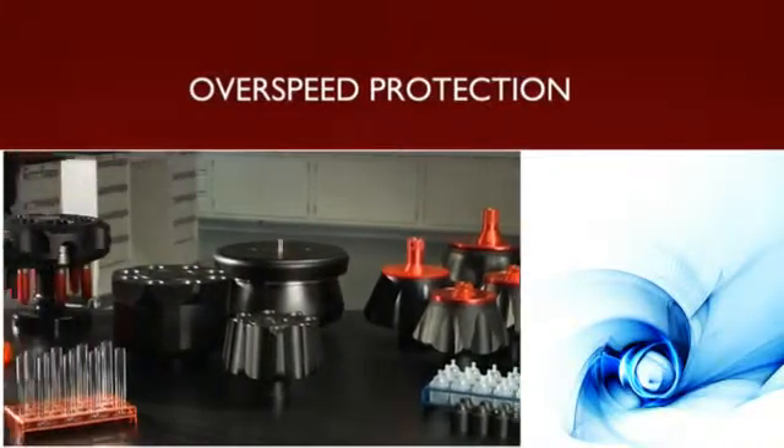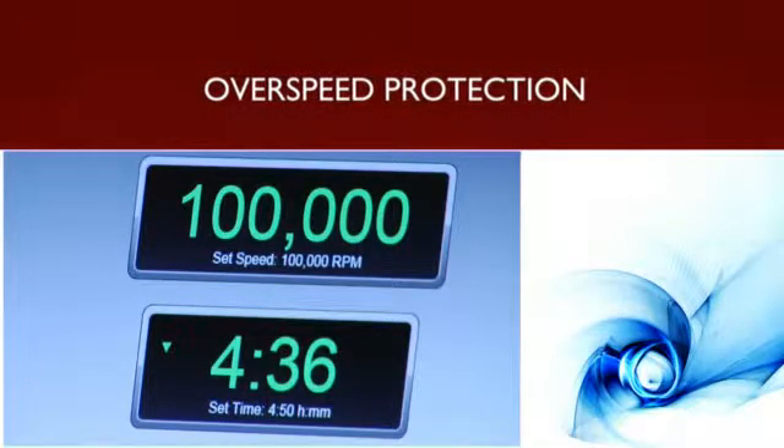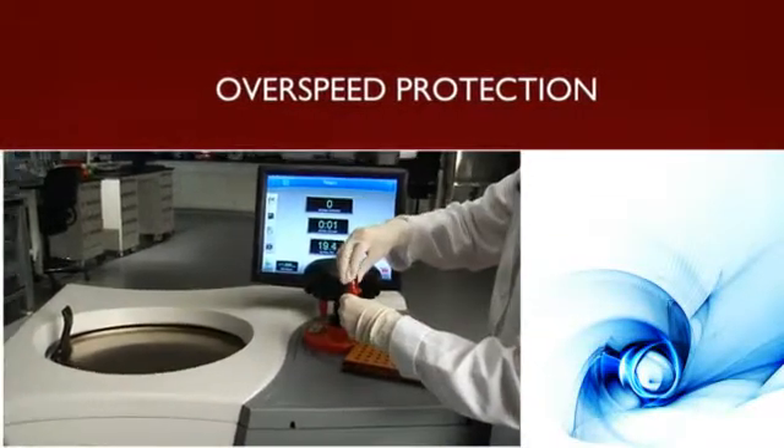Our rotors provide overspeed protection that uses optical sensors to ensure the maximum permitted speed is not exceeded, thereby jeopardizing your samples or your safety.